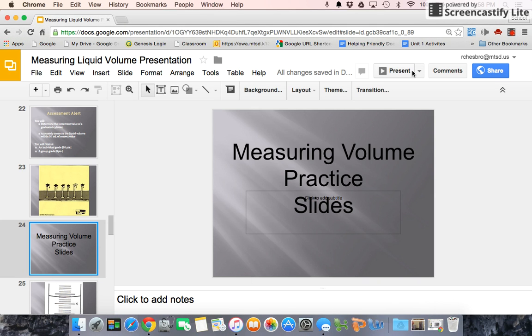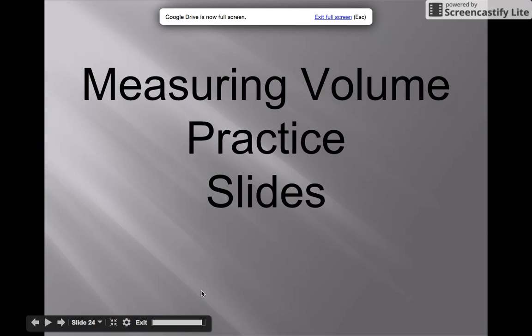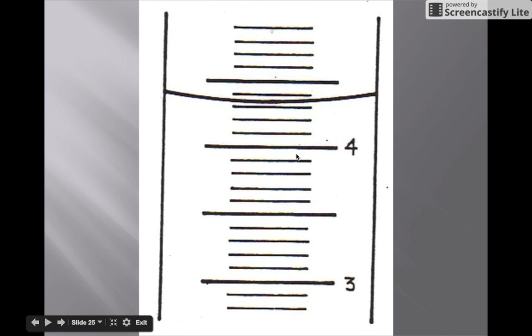Here's a tutorial video to help you practice measuring liquid volume in a graduated cylinder. So when you look at a graduated cylinder, the first thing you have to figure out is the value of one increment or one interval.